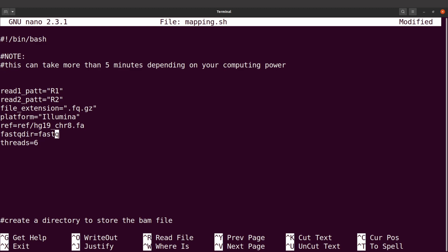So just make sure that you have supplied all the information as it is. Okay, and if you are using your own data, just make sure that you supply the appropriate information here. All right. So in principle, this script can be used on your own data. So that's why I'm showing you the information that you need to specify so that you can use it. All right. So let's proceed. So we can now proceed with the exercise.